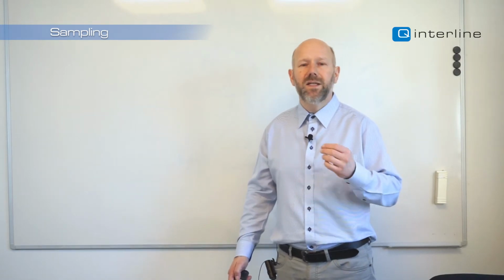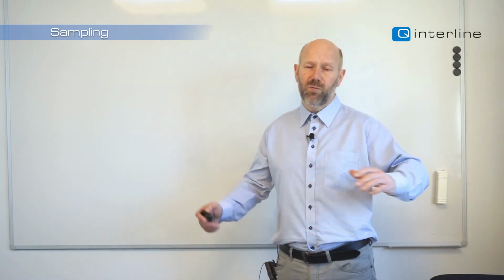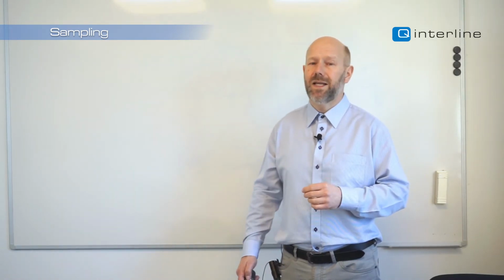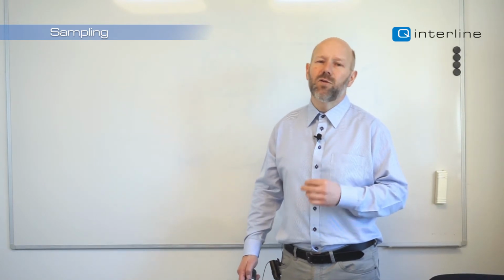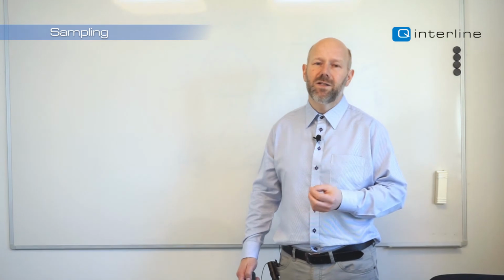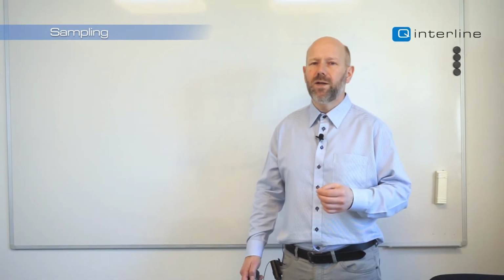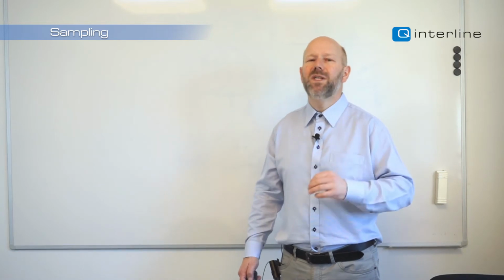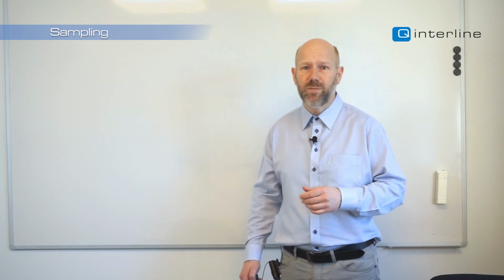Generally speaking, detectors with a narrow band may be more sensitive, whereas broadband detectors are slightly less. Nowadays, there are good combinations, and a quant will typically come with an InGaAs 2.6 or an InAs detector covering the entire region quite well, but there might be other things limiting the spectral range. Let's look at a typical spectrum.